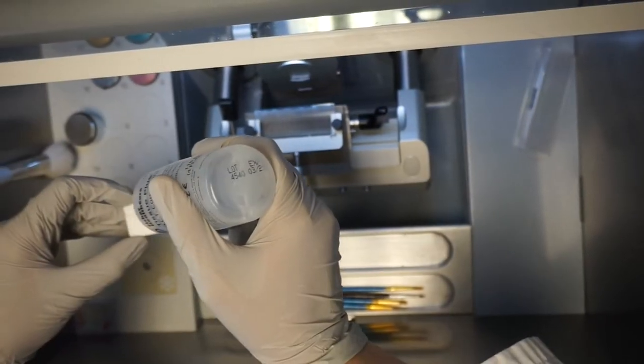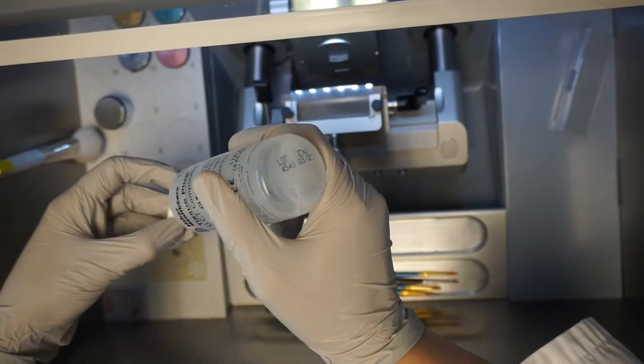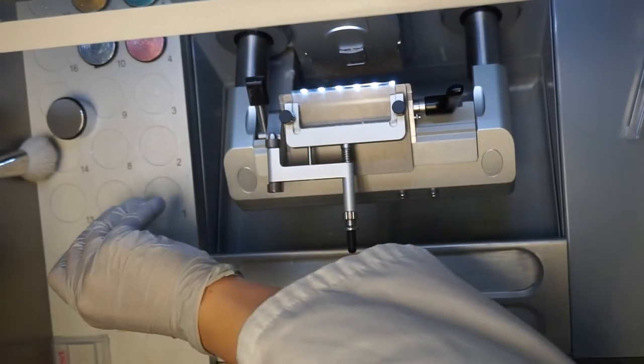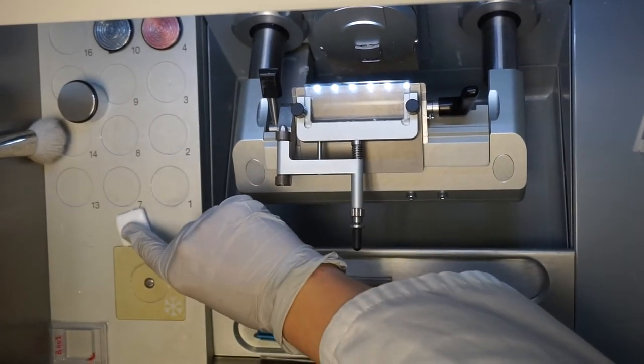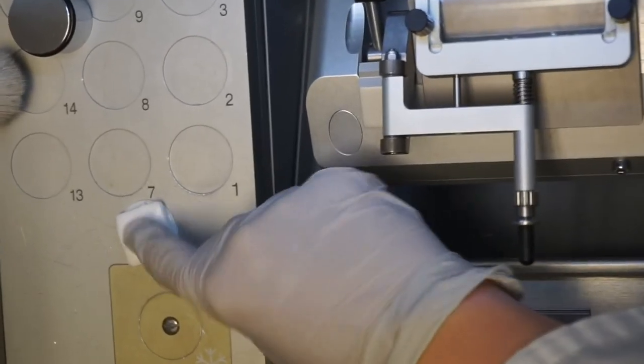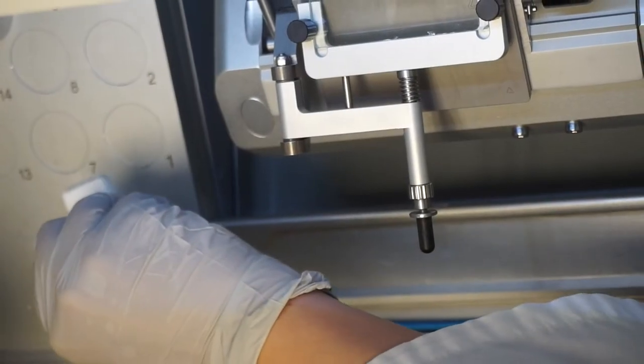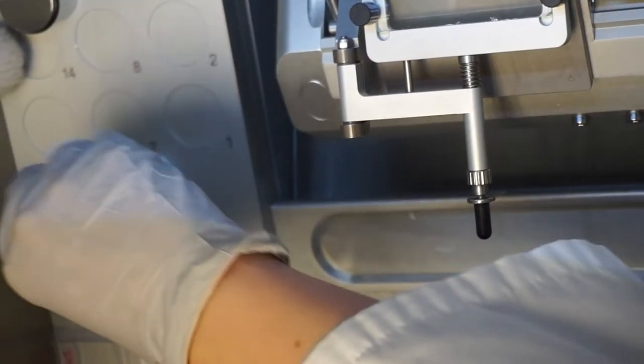Evenly cover the surface of the block that will be in contact with the blade with a thin layer of OCT. Press it down on the cooled storage area to make it flat. Remove it when the OCT has solidified. Trim with a razor blade to have straight edges. Should the orientation of the block matter, be sure to keep track of it at this stage.